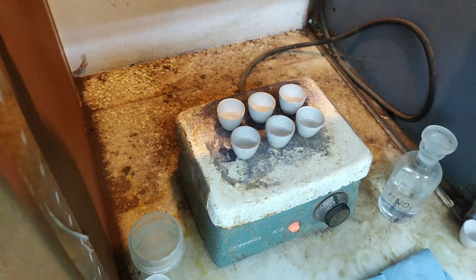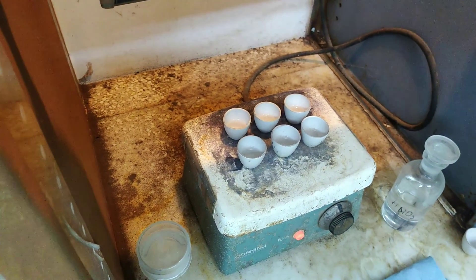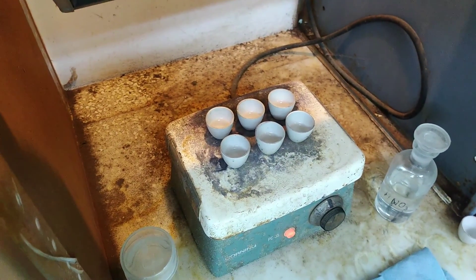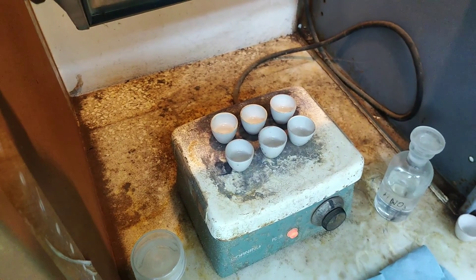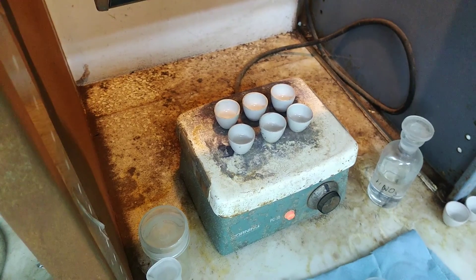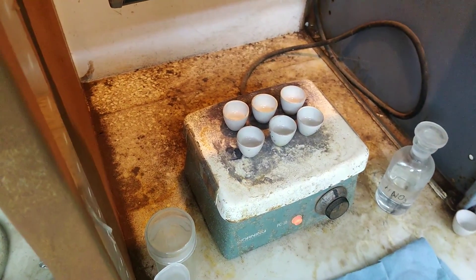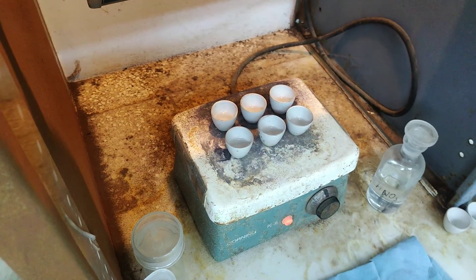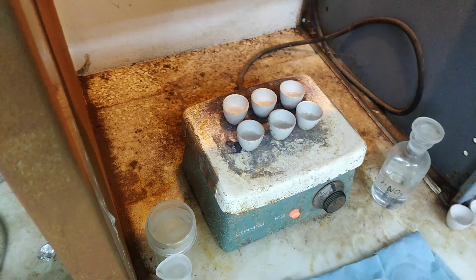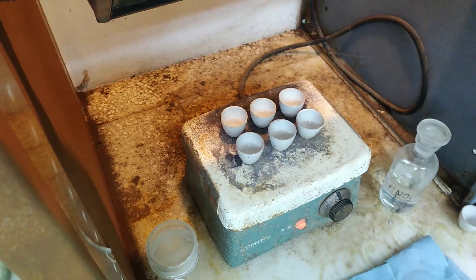The initial two samples, number one and number two, didn't run especially hot unless there's a lot of gold in there. But the one lower down was decent. We'll be waiting on the final numbers because the silver value is going to be that 3.8 inquart minus the gold minus the actual measured silver value.